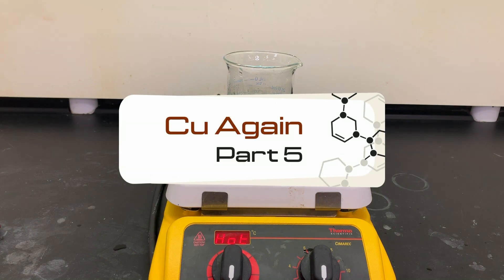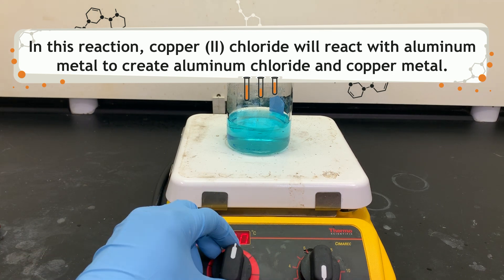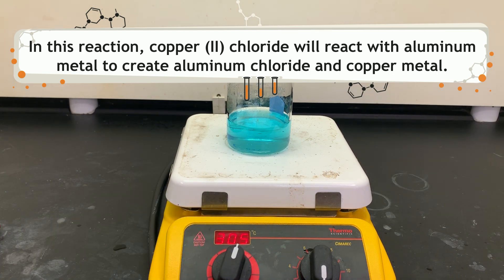We are on to our last reaction. In this reaction, we are going to take that copper 2 chloride and react it with aluminum metal. This will create aluminum chloride and copper metal.